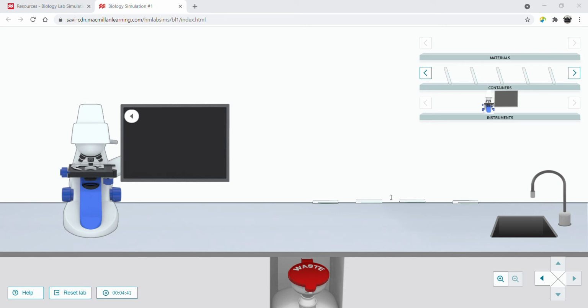The first one is on page 5, and it is an amoeba, which is a single-celled protist. They're just really cool. They live in water, and they have those really cool pseudopods where they just kind of shimmy their way around the water, and when they want to consume something, they wrap their pseudopods, their slimy stuff, their cytoplasm, around it and form a vesicle, and then they ingest it. It's pretty cool. So here's our amoeba.